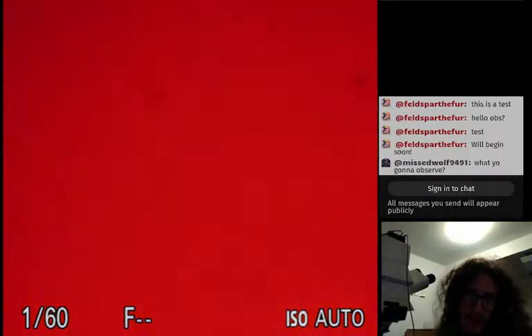What's the light? This little guy is the dandelion seed thing. It's red because I put the red filter on it, so it's easier to see parts of it. The stem. Otherwise my camera and my eyes go a little weird.